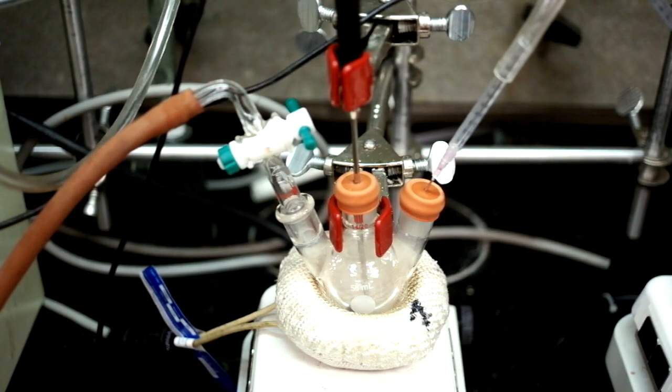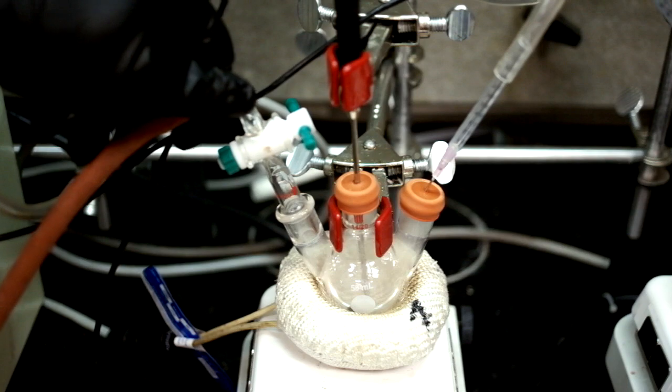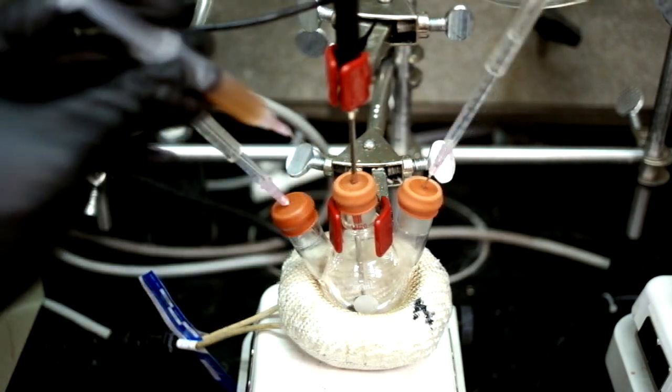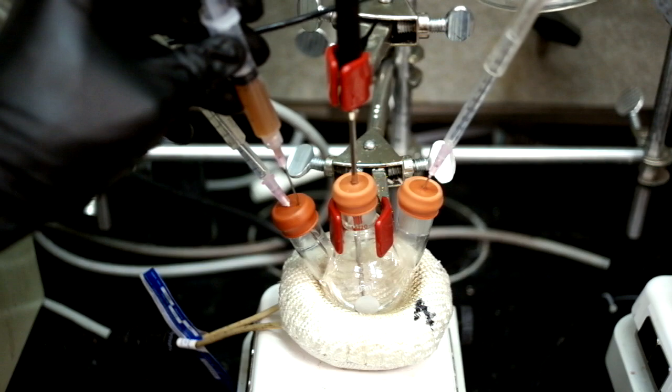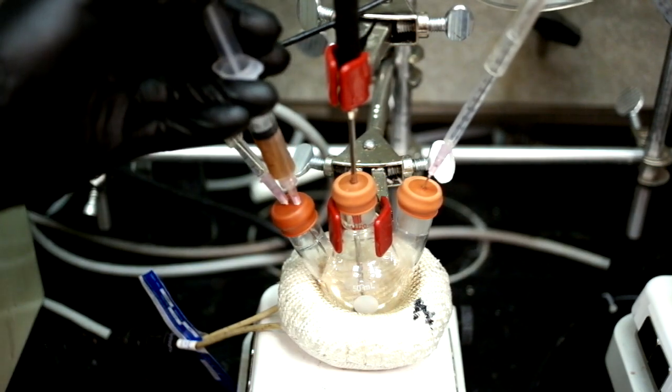After the hour of degassing, the reaction flask will be a clear solution. We can switch it to argon now and add half of the zinc telluride cores from the previous procedure shown in another video.